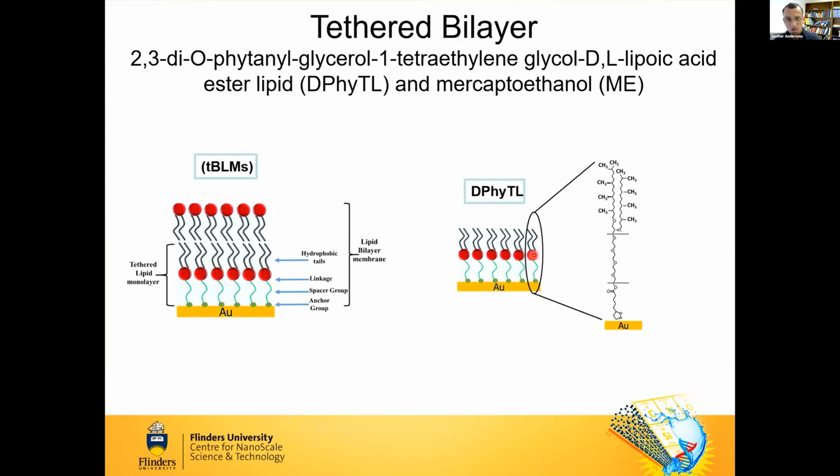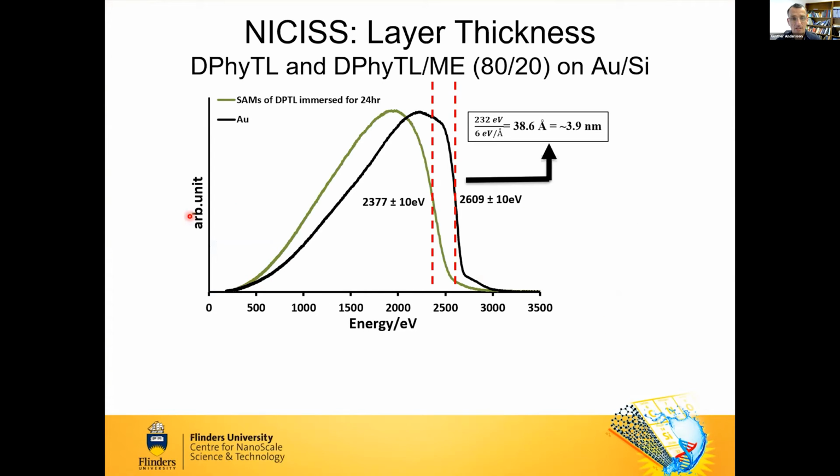However, what is also quite interesting is that you can determine what these layers actually look like. So what structure would you get? Let's say you were aiming to cover a surface, say a gold surface, with such a structure here. Would you eventually get this structure at the surface, or would it look different? This is a question which the technique I've just introduced can actually answer.